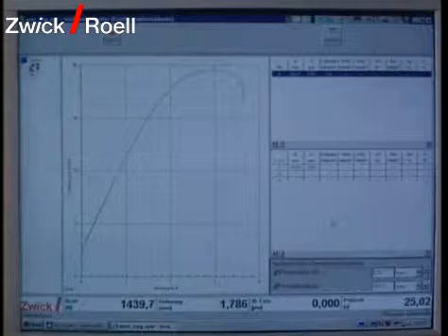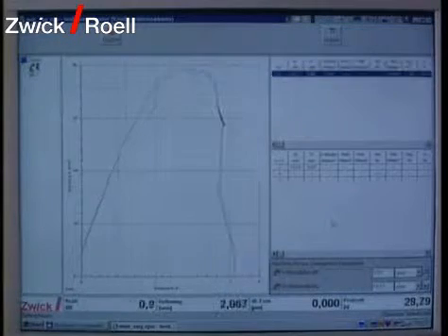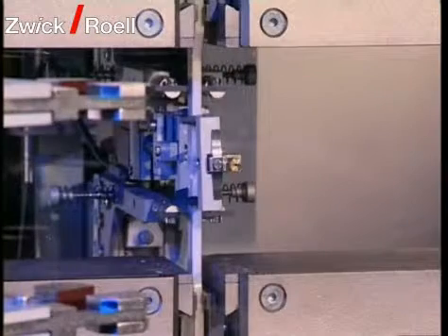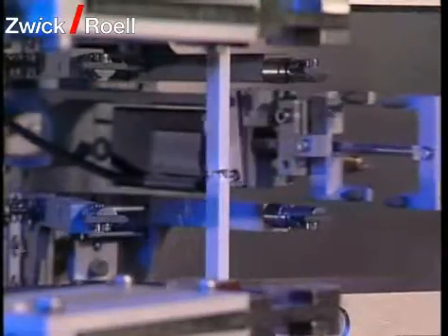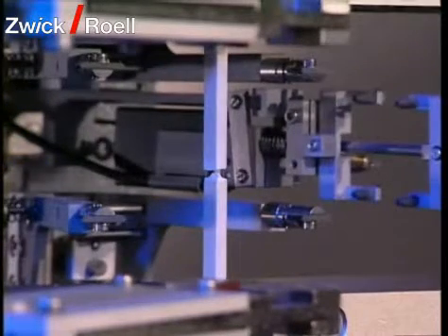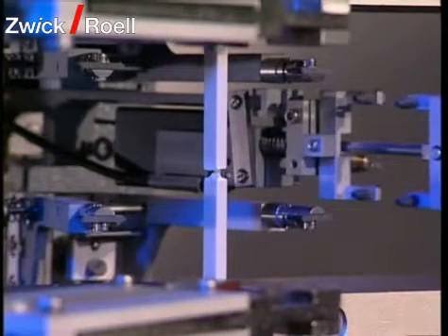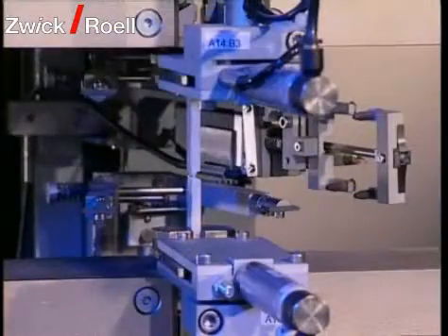For control, the operator can follow the tensile test on the screen. After the test, the specimen remains are taken out of the grips with special grippers and removed.